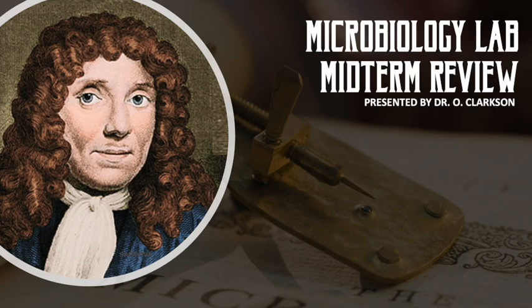Now, if you have a mixed culture and you're trying to subculture from that, what's the best way to isolate those colonies on a mixed culture? You use it on a plate. Yeah, the streak plate method, exactly. So you can thin out the colonies, and then you can have isolated different types of bacteria.